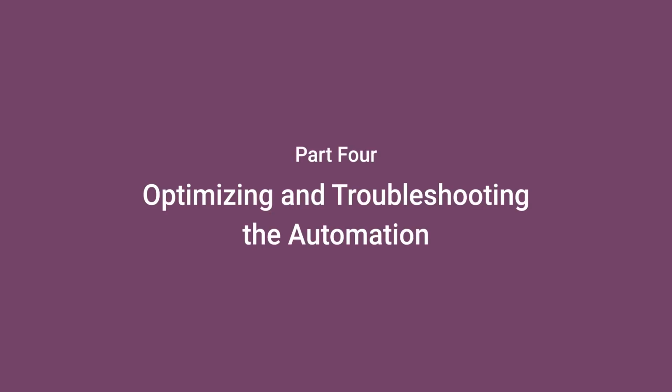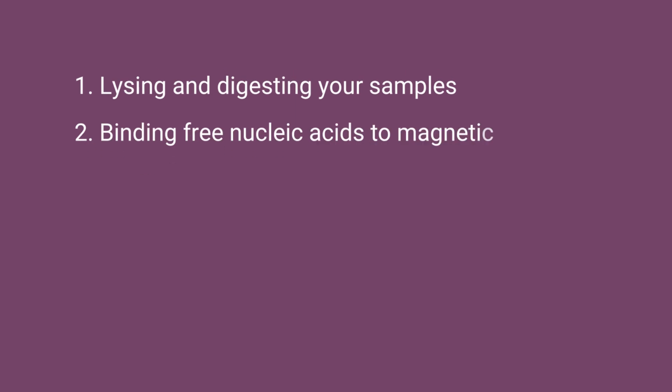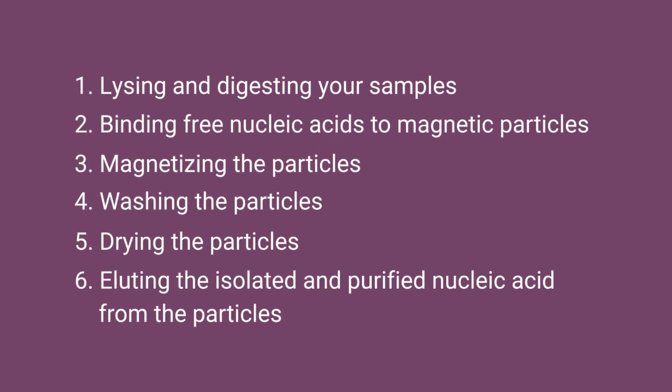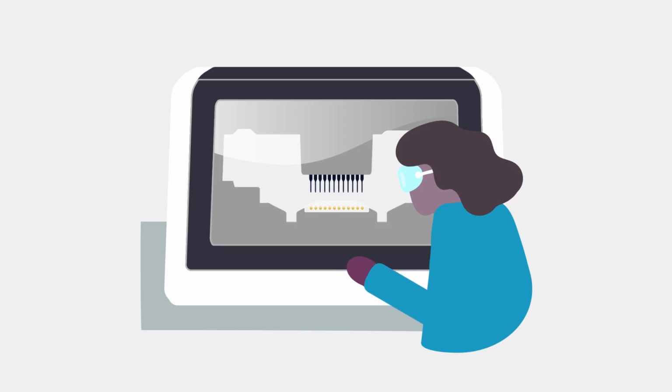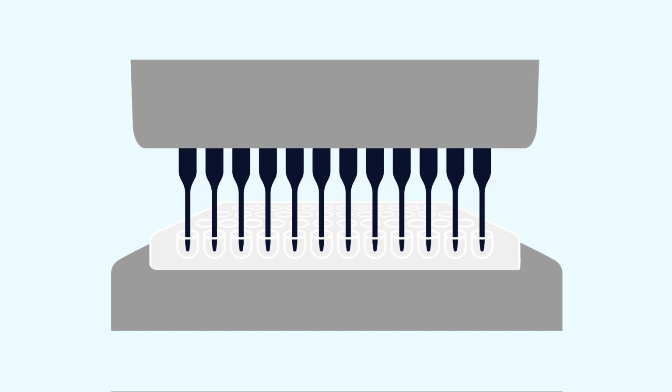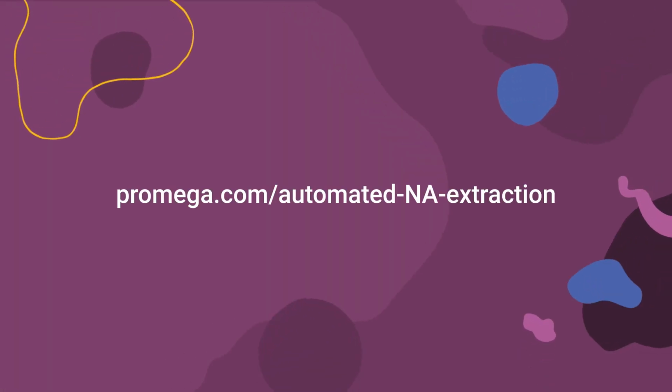Let's summarize. There are 6 stages to an automated magnetic particle-based nucleic acid extraction. You can efficiently optimize each of these steps by taking an iterative and informed approach. Knowing the chemistry and robotics of the workflow can help you troubleshoot any one of these steps and create an automated workflow that meets your quality and throughput needs.